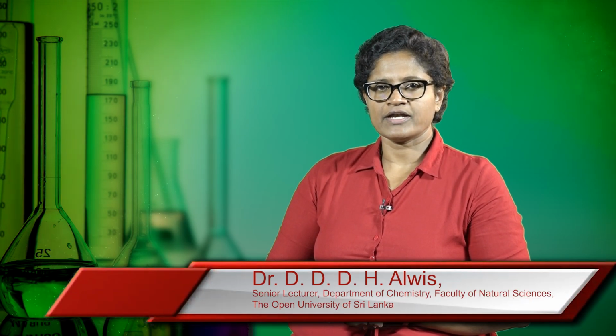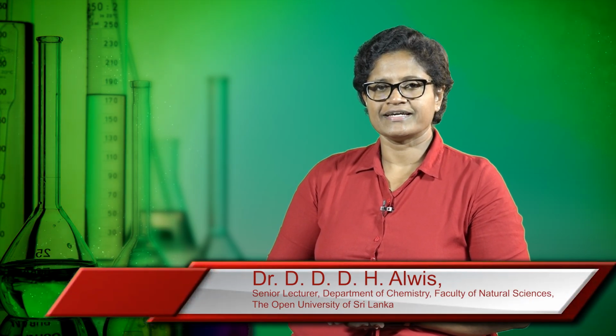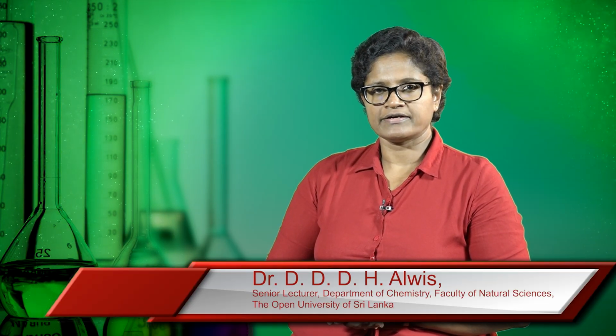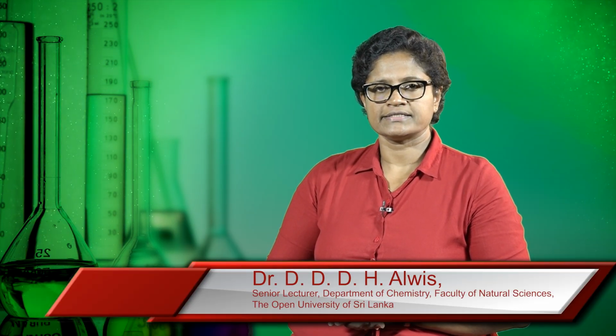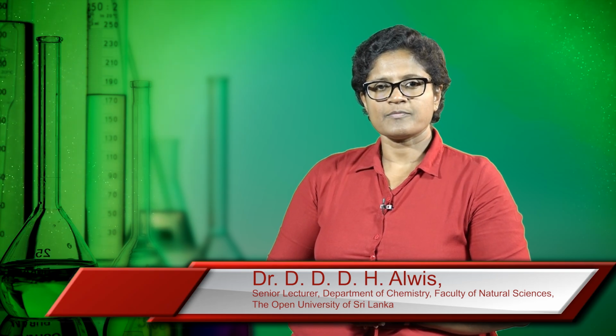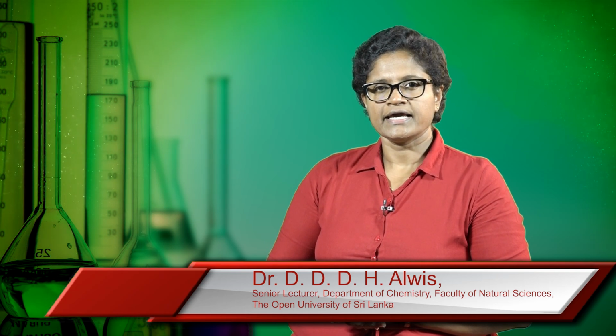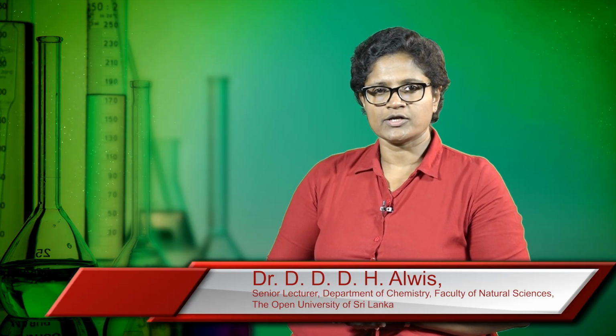Hello everyone, today I am going to demonstrate the Kjeldahl method, which we can use to determine total nitrogen or protein content. This is the reference method for determining the protein content in any material including food. Proteins have a major role by providing amino acids for the growth, repair and maintenance of the body tissues.